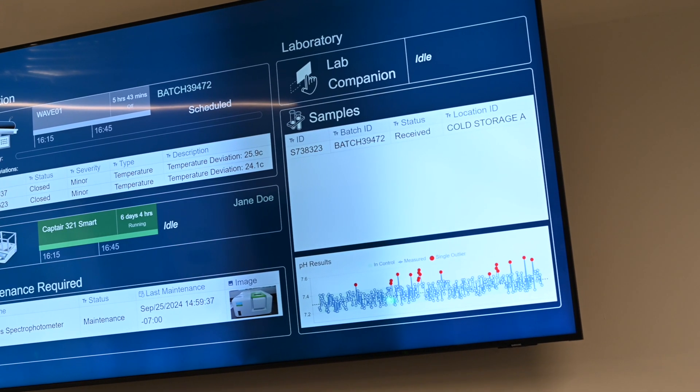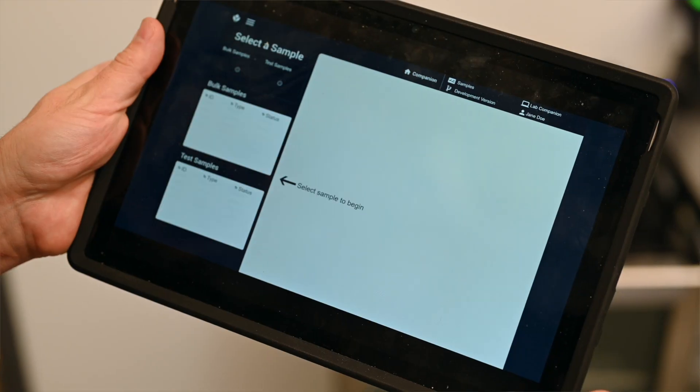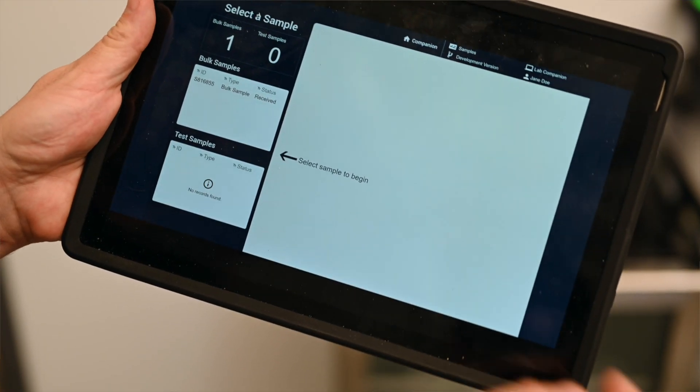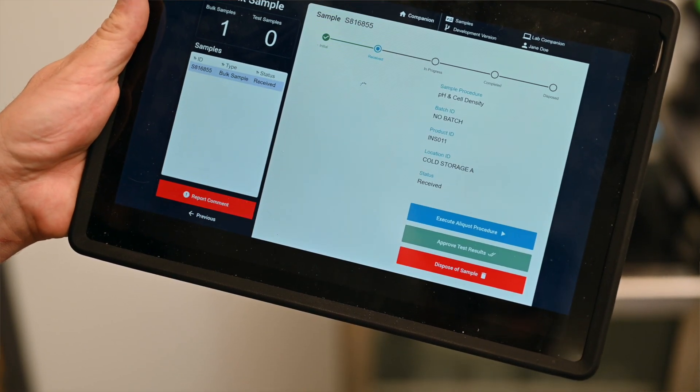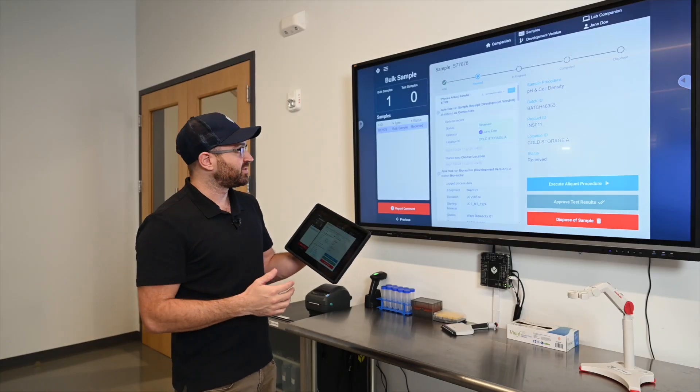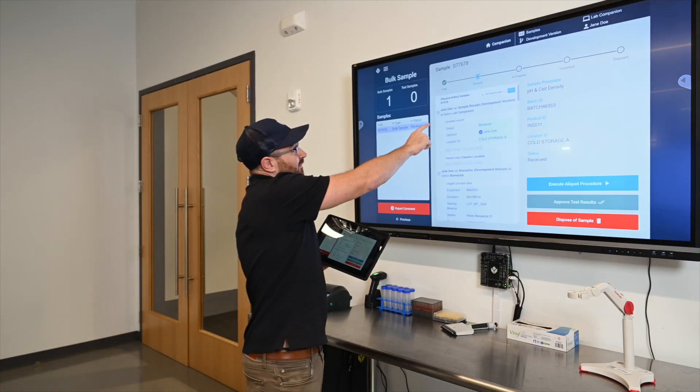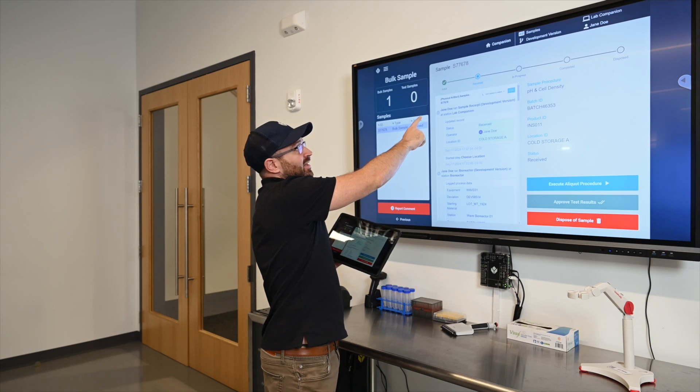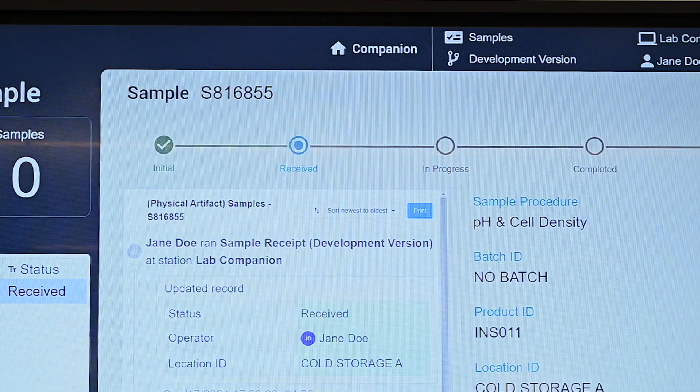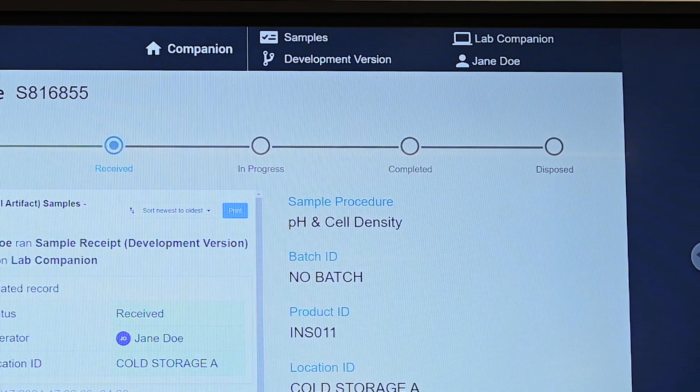As a lab analyst I can look at my samples and I have two types: bulk samples and test samples. Bulk samples are the samples that come directly from the lab and they have a lifecycle where first it's initially taken, then it's received, then it's in progress, completed, and finally we dispose of it.